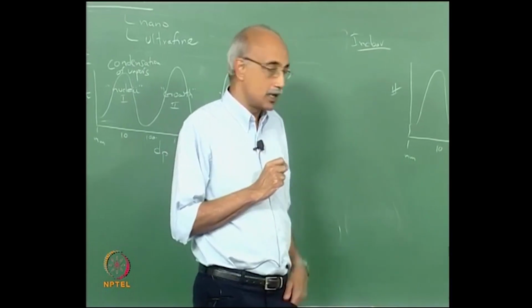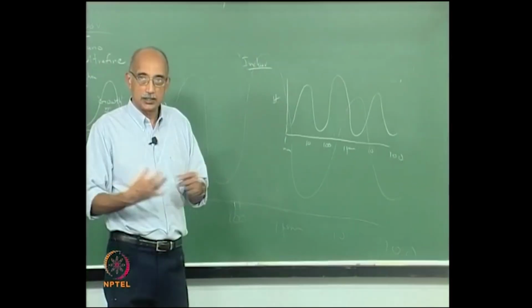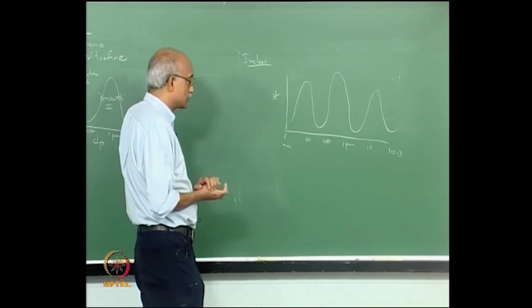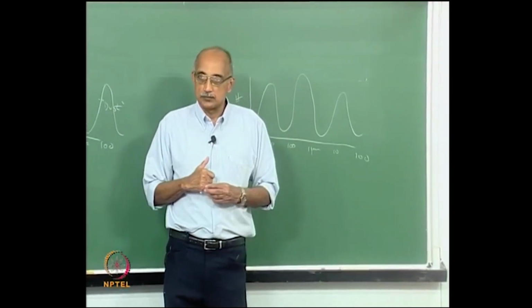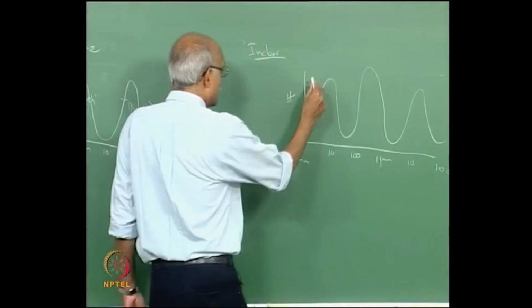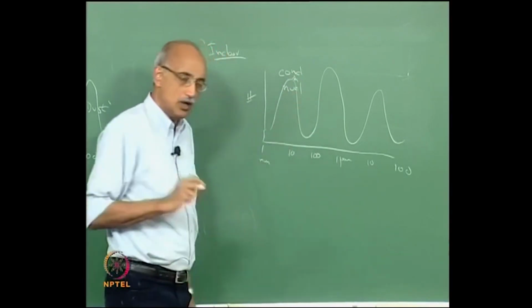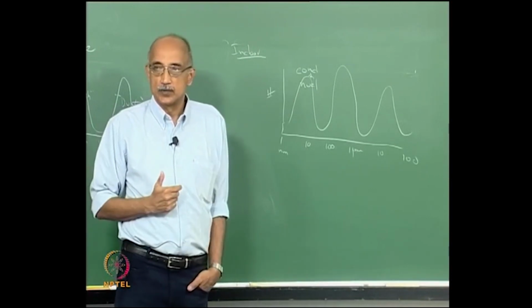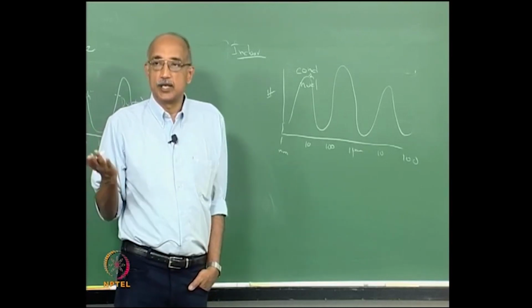So under those conditions, obviously these peaks are going to be very small because it's a well controlled and cleaned environment. However, it's very interesting and intriguing that in terms of the qualitative nature of the particle size distribution, it retains this trimodal characteristic. And the reason for that is that the first phenomenon of condensation and nucleation also happens inside even a room like this. Now why is that? Well, there's a couple of reasons. One is that all materials outgas.